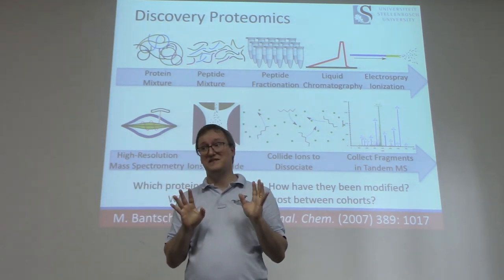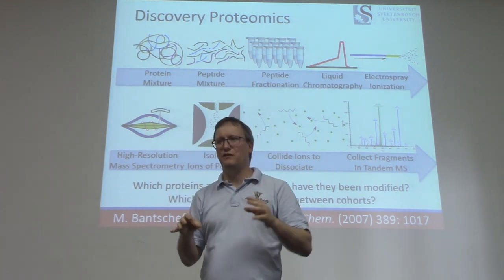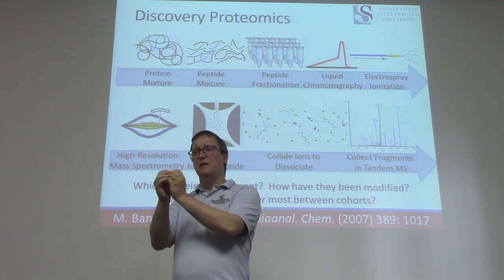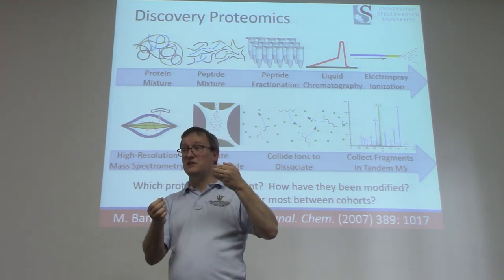I mean, the electrospray process is not nice, right? You're zapping them with a few thousand volts in hopes that some of them take on a couple protons or three protons, something like that. But these are still peptides as they flow into the mass spec.